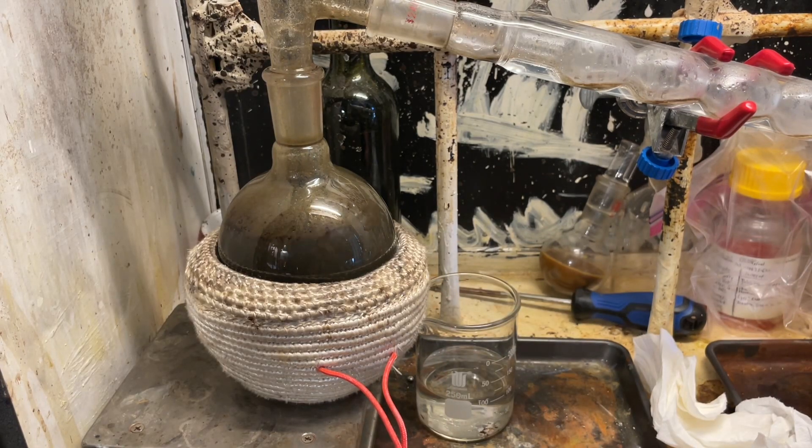Boiling much better. Now we get some tar in our product.